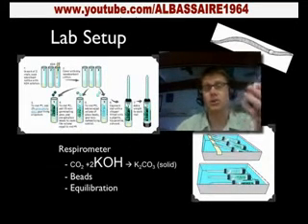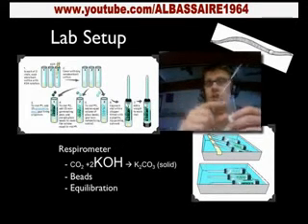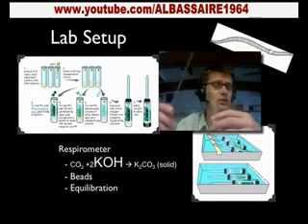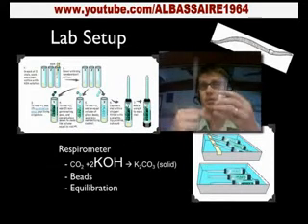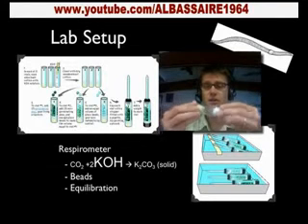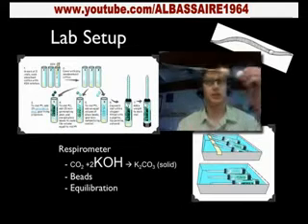And so if we were to do, for example, germinating peas, we'd measure out a certain amount of germinating peas, and they'd go in here, or we'd put a worm in here. And then we want to make sure in all our other respirometers that we control the volume, because volume is going to be really important. And so we usually add glass beads to the respirometer, and that makes sure the volume in each one is exactly the same. And then we stopper it, make sure it's really airtight at the top, and now we've got a respirometer.